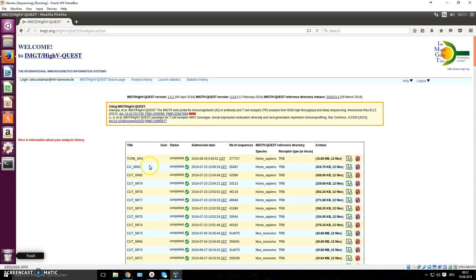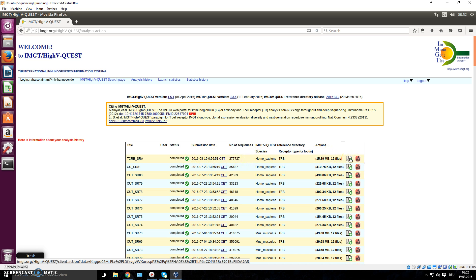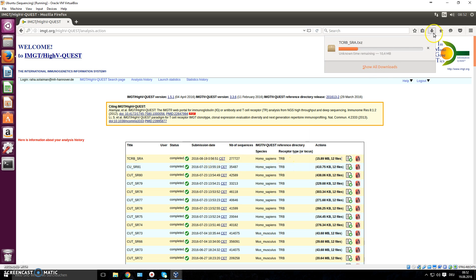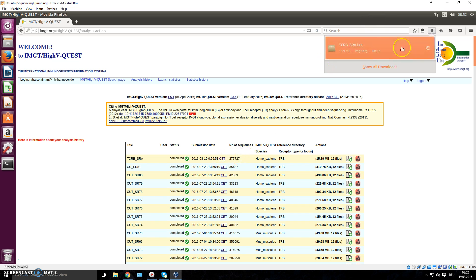In this case the annotation or alignment worked out to be a bit faster and it finished in about 12 hours. We will now download this — you just click here and download that package they send you. It should now be in our downloads folder. This one is about 50 megabytes, which is actually quite a lot for these sequences.